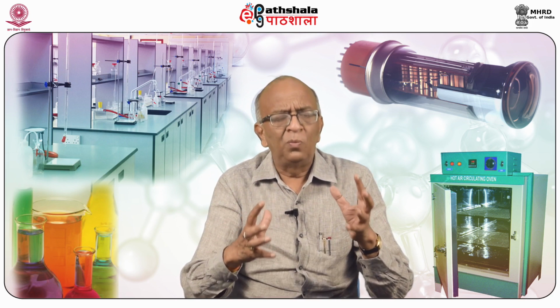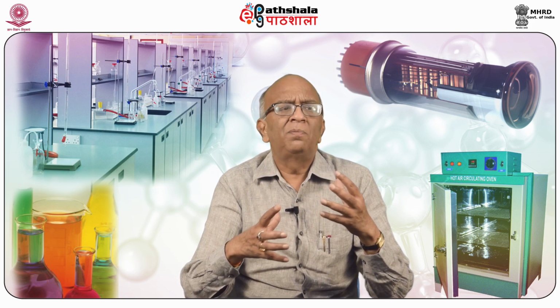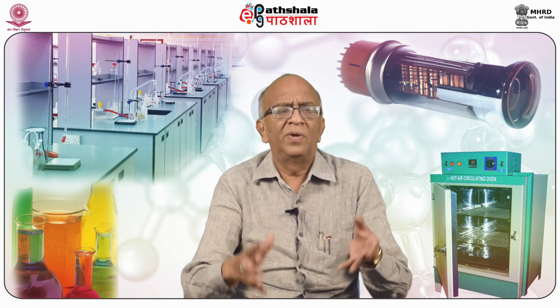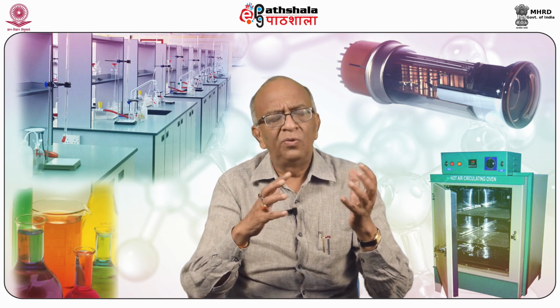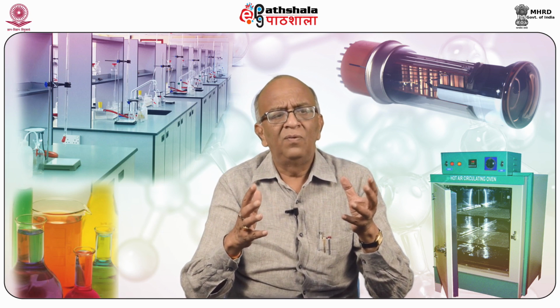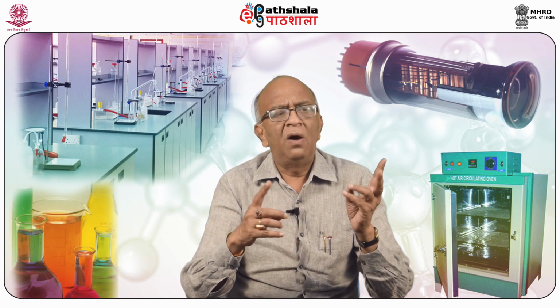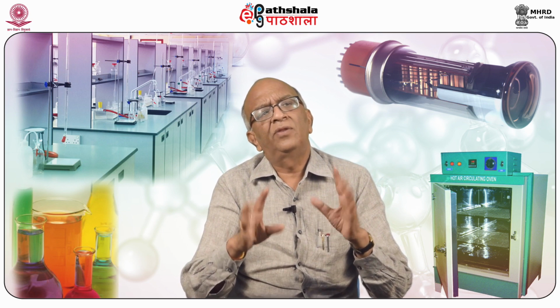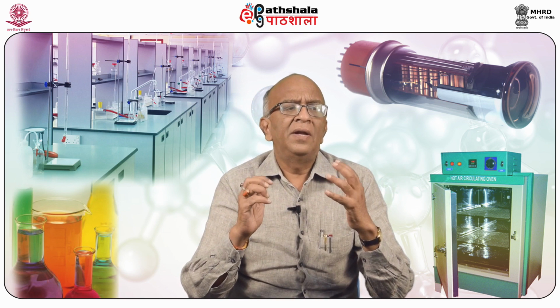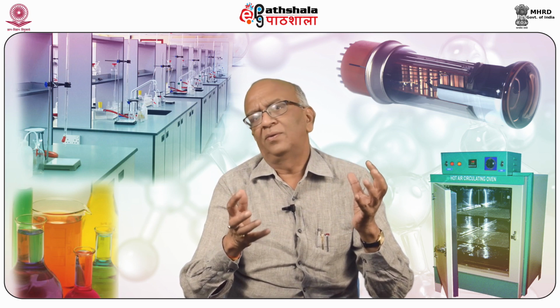The instruments and glassware which are not in use should be placed in the shelves, in the cupboards, beneath your working bench. And on the working bench, only those glassware should be there which are in use. And here you will learn how to clean these glassware, how to calibrate these glassware, and how to maintain good laboratory practices.